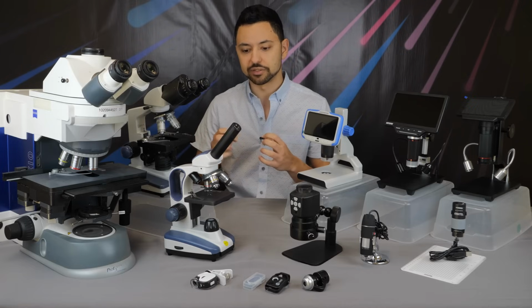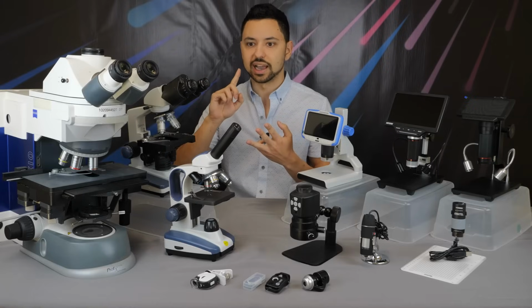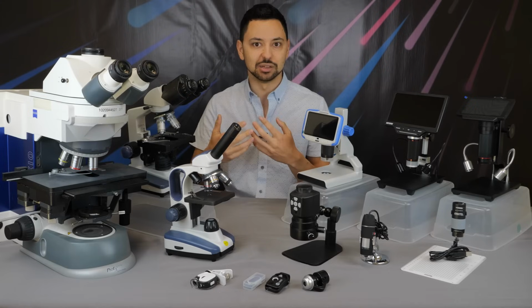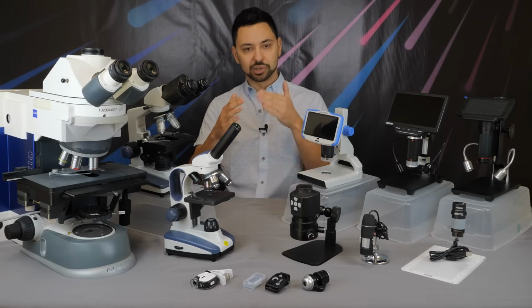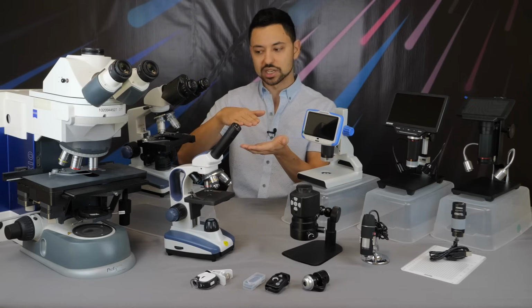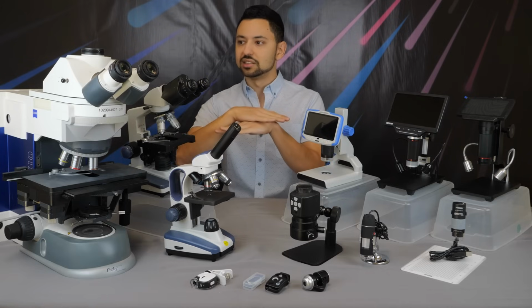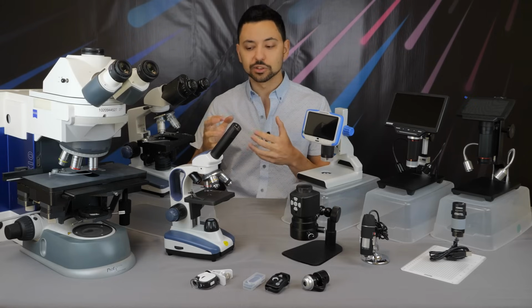But very specifically, if you're looking at bacteria, water samples, or tissue samples where you have to slice, this can be mammalian tissues or it can be plant tissues. Let's just say plant tissues for now. You'd have to take the plant sample and slice off extremely thin sections, put that on a microscope slide, slap a cover slip on top of it, and make sure that that slice is extremely flat and consistent. Otherwise, the focal plane is going to be all over the place.